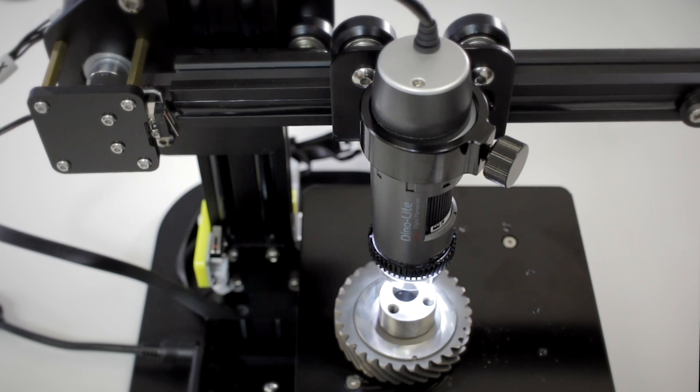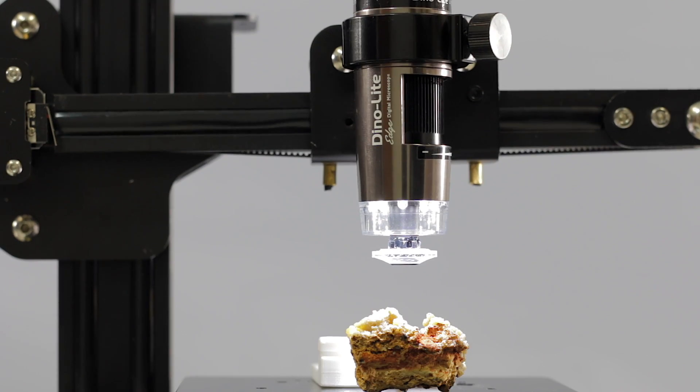The USB-controlled stage has precision movement down to as little as 20 microns.